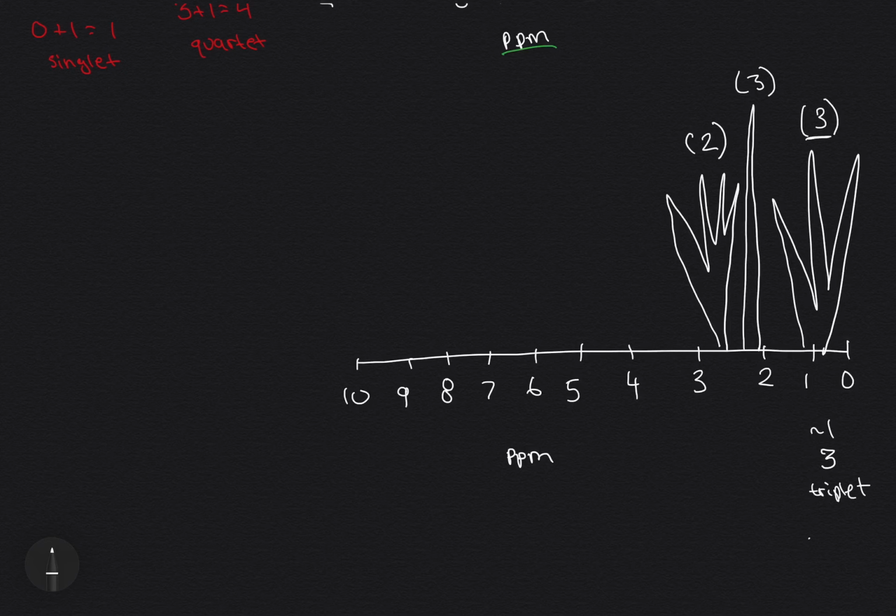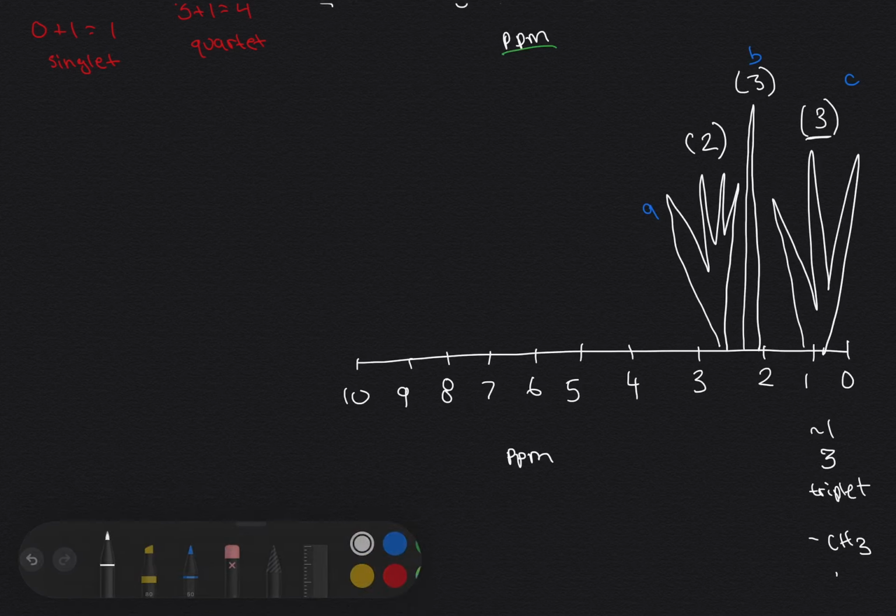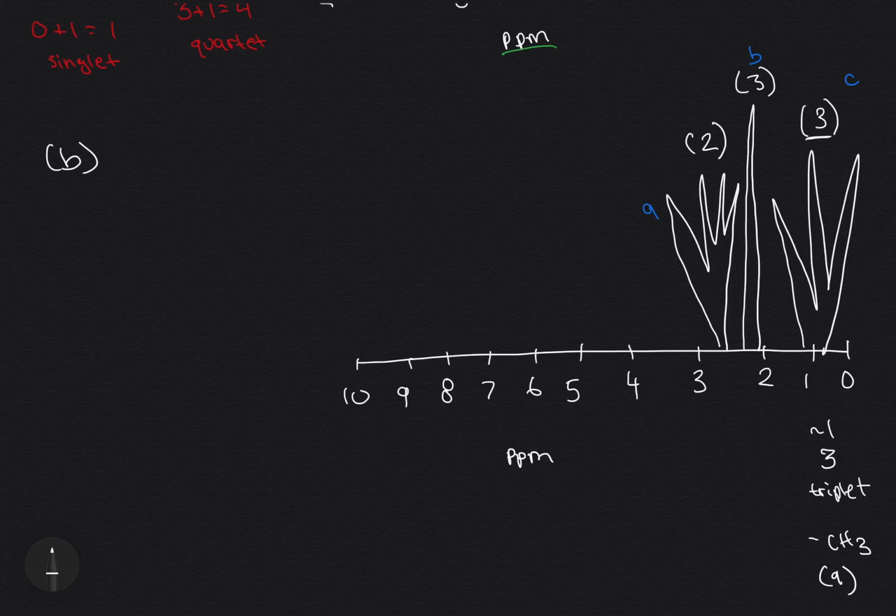So we can go and write out, let's just say a CH3 group, because we know there's probably a CH3 there. Okay, this next one. Now this one's a little harder. We have a singlet. Let me just label these A, B, and C, just so I can draw. Over here we have more space. This is A. Okay, so B, we'll draw it over here. We have a singlet. Just writing out what we know here.